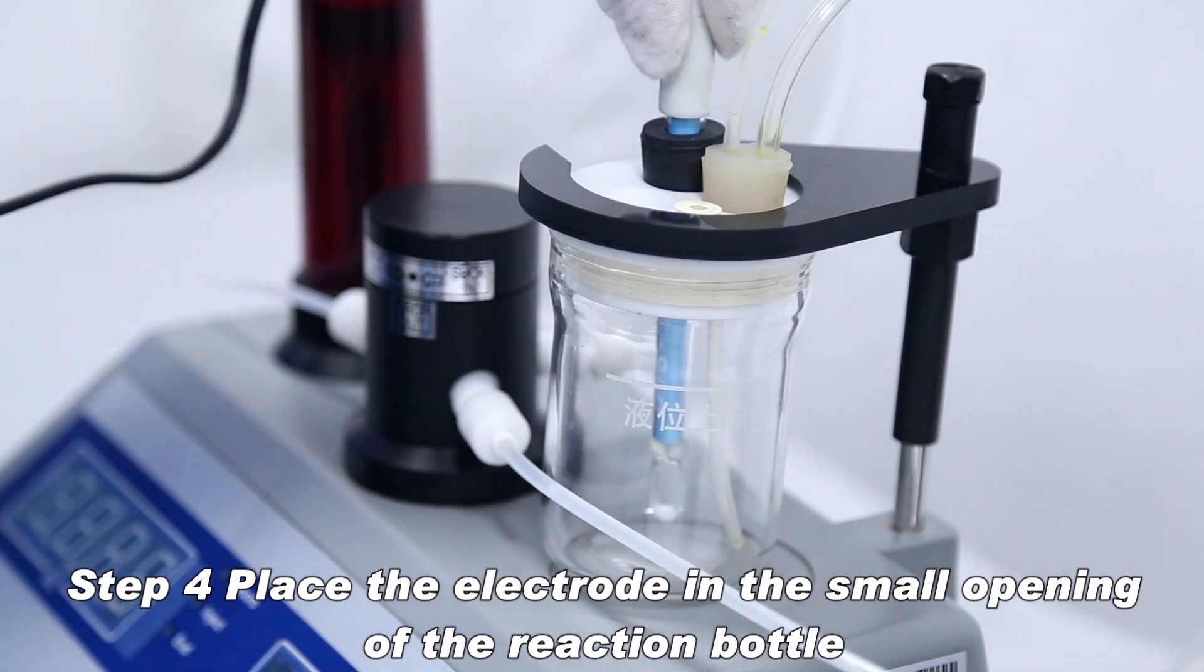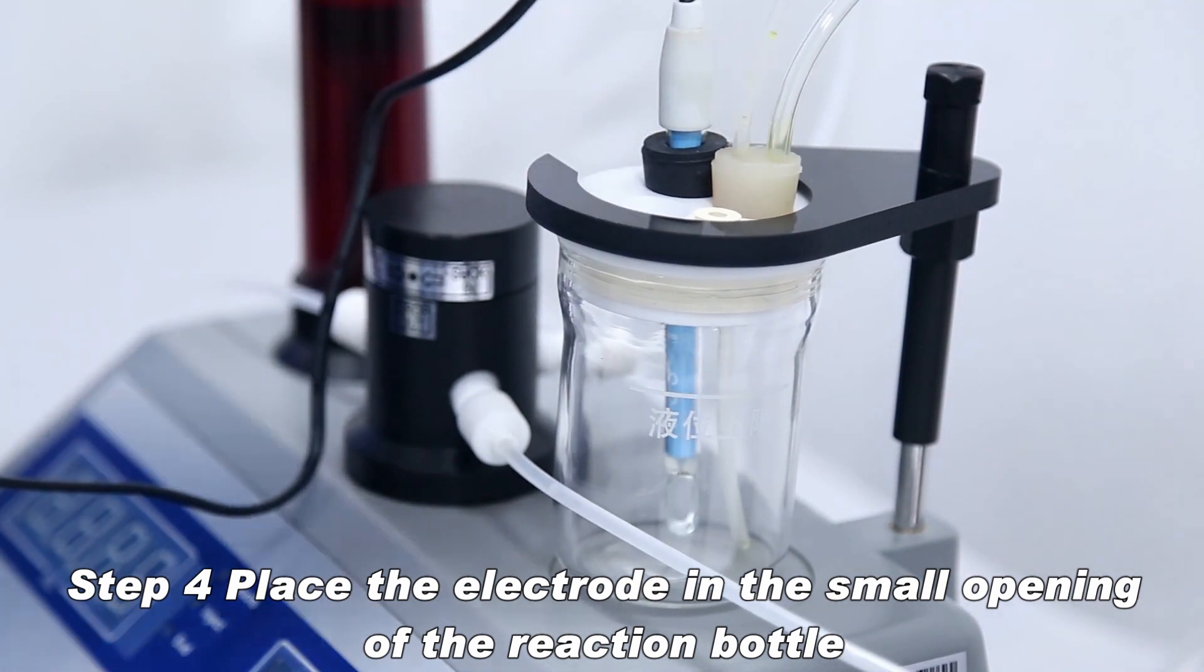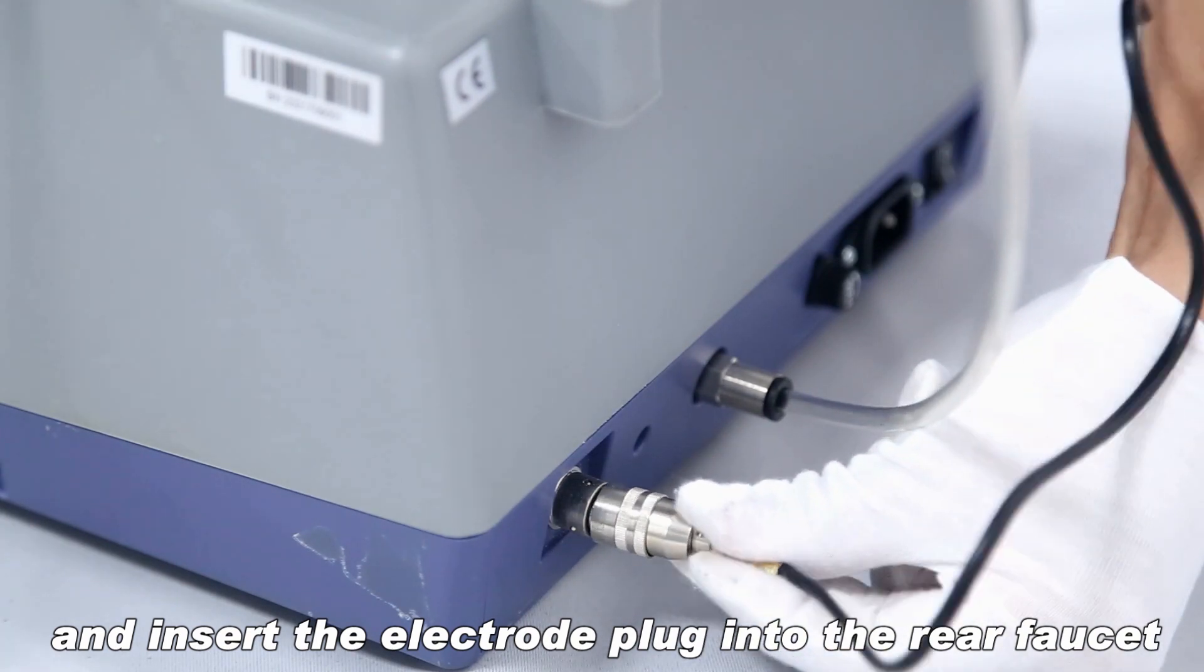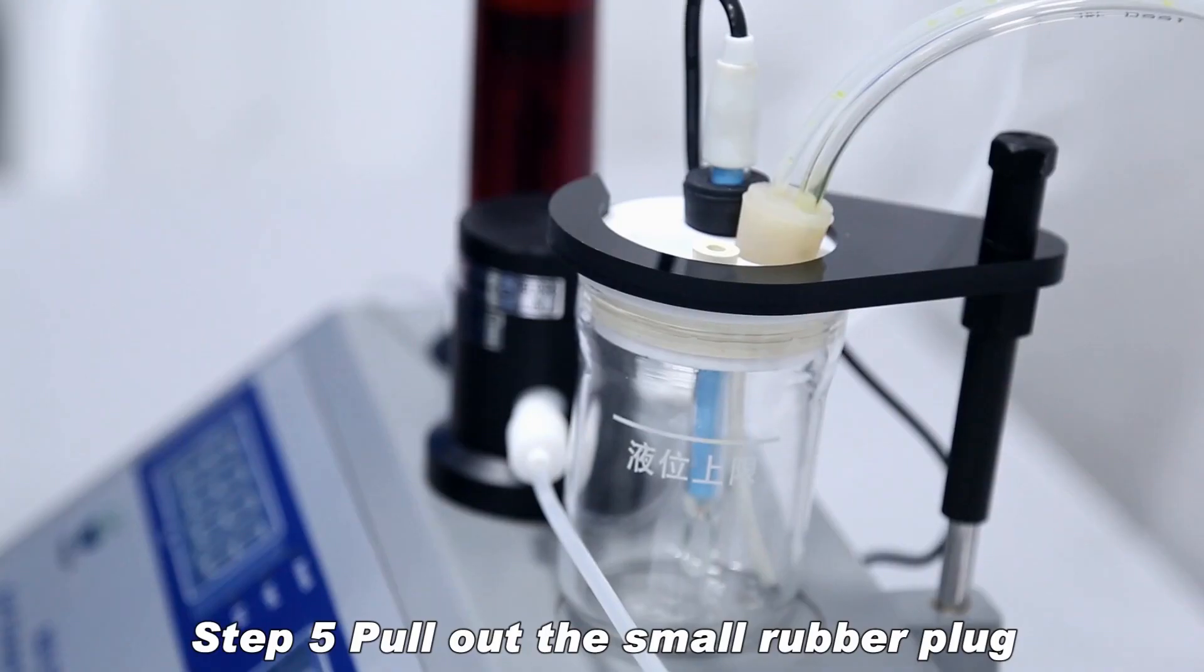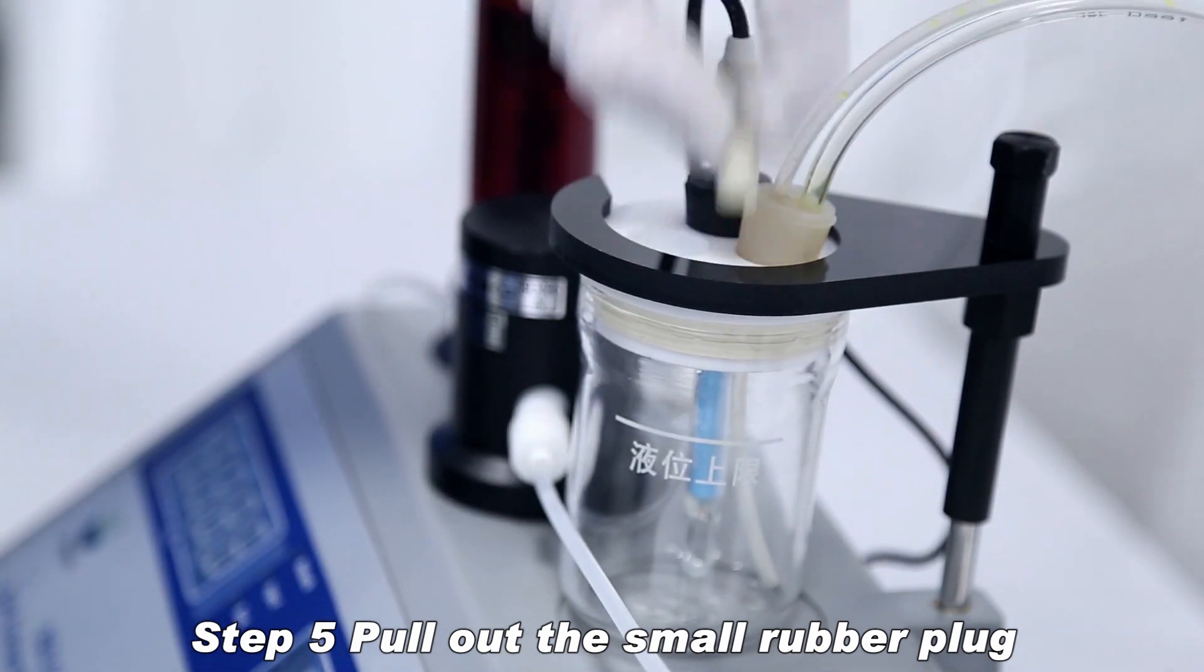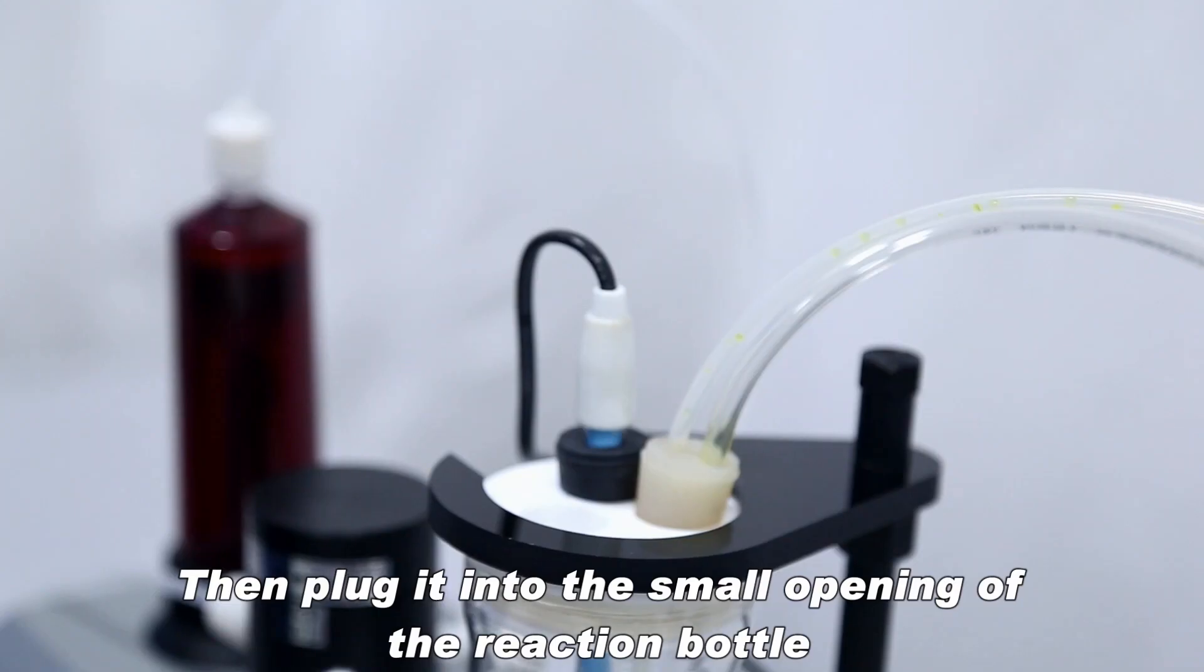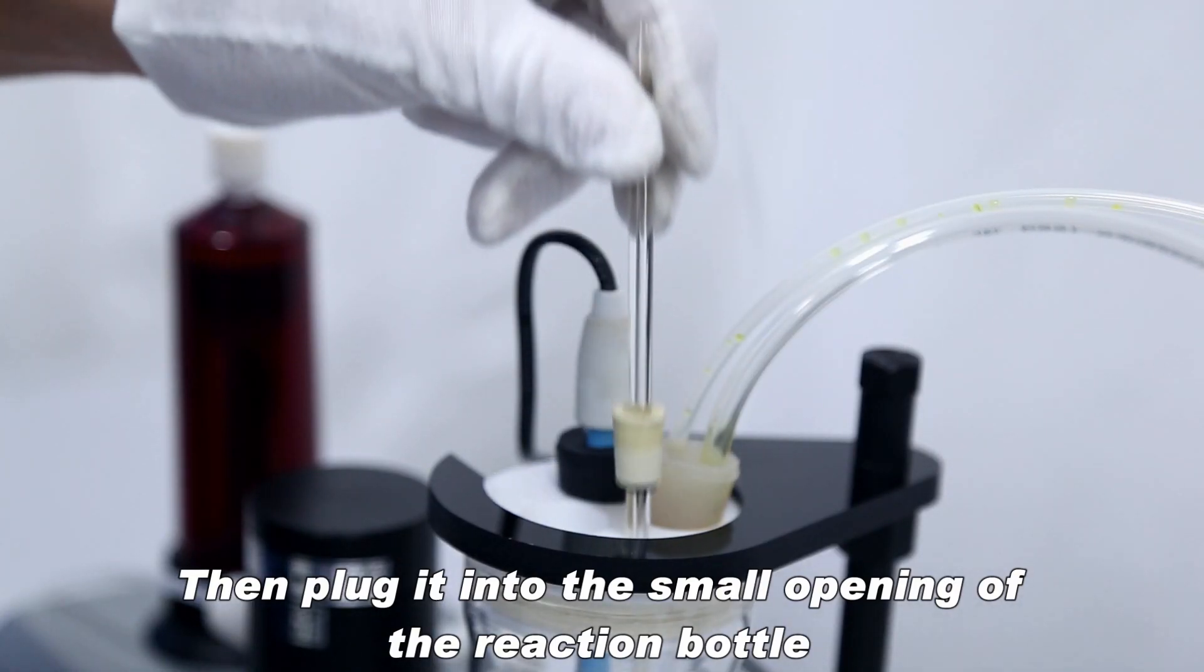Place the electrode in the small opening of the reaction bottle and insert the electrode plug into the rear socket. Pull out the small rubber plug and insert the dropper into the small hole of the rubber plug, then plug it into the small opening of the reaction bottle.